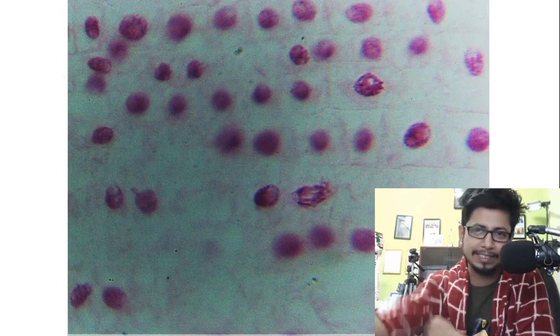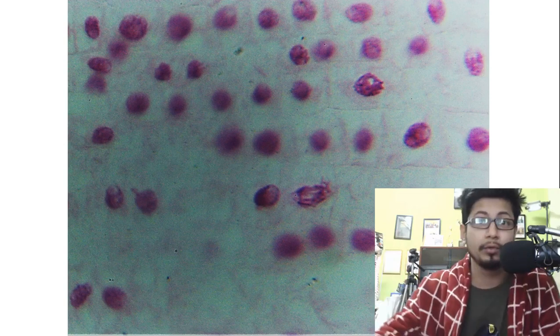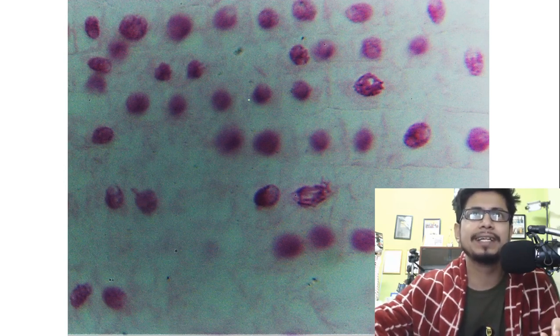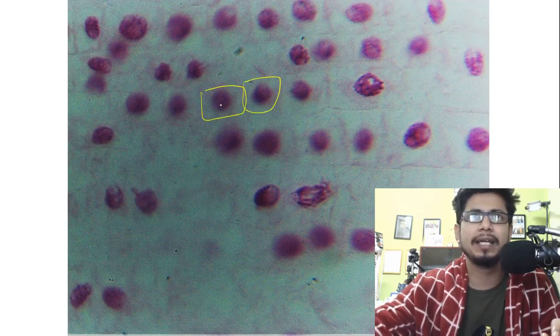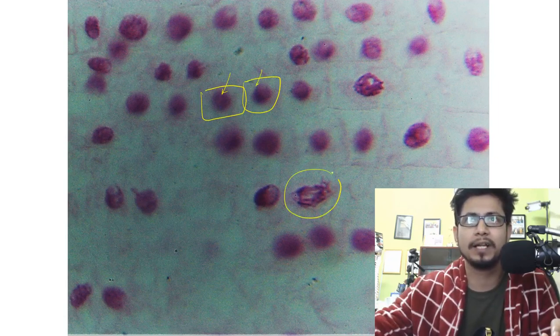Again we are looking at some beautiful pictures from the onion root tip mitosis. In this picture you can clearly see the dimensions of the cells — this is one cell, this is another cell, and they are in the prophase phase of their cell division.